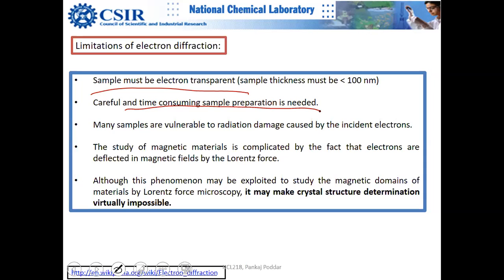The life of a physicist and engineer is very difficult because for sample preparation they need to cut from a thick slab. That's why I spent a little time on that slide earlier. I was telling about this strontium titanate and lanthanum vanadate palladium multilayer structure. Because we are so biased with chemistry samples, they need to microtome it, actually ultramicrotome it, cutting it into thin slices.